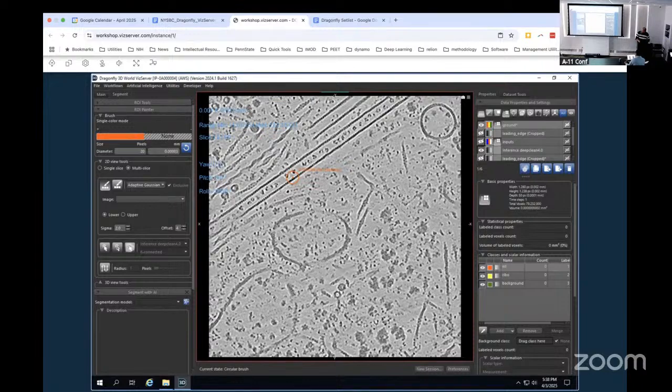And if you hold the control button and scroll, and oh, come on, please work. Okay. Oh no. Yeah. One of the really convenient things in Dragonfly here is that if you hold control, you can scroll your mouse wheel and it will just adaptively change the size of your brush. And so while you're painting, you can just very quickly do that. But man, with these cloud instances, it's very difficult to sort of pull off. Okay, see that, we can sort of scroll up and down.